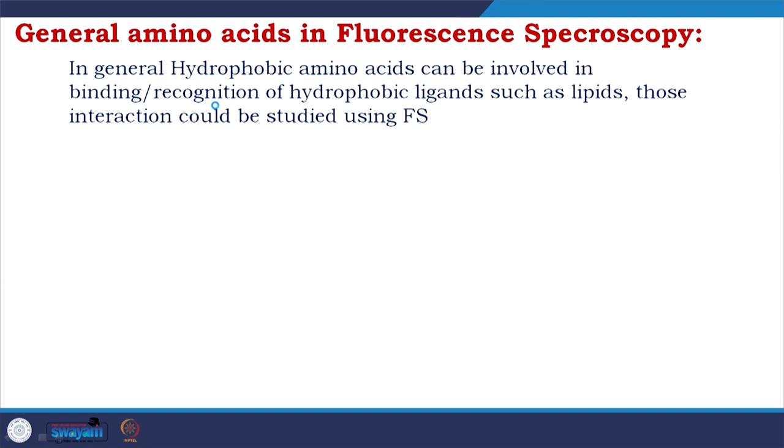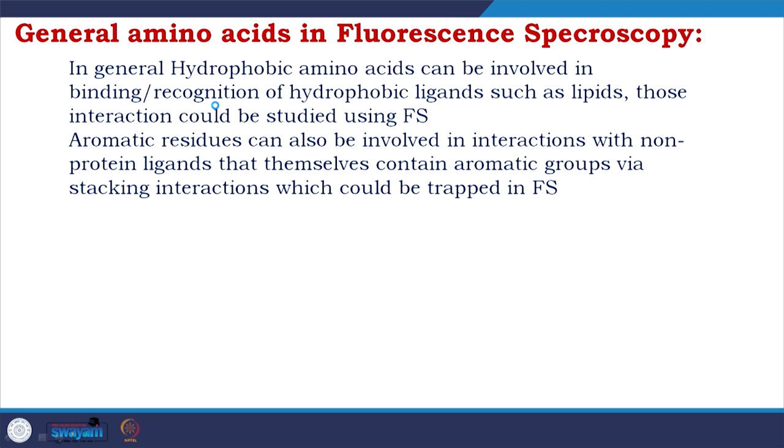So, if we look at other amino acids, in general, hydrophobic amino acids can be involved in binding recognition of hydrophobic ligands such as lipids, and those interactions could be studied using fluorescence spectra if we have a proper lipid containing a fluorescent group. Aromatic residues can also be involved in interaction with non-protein ligands that themselves contain aromatic groups via stacking interaction, which could again be studied using fluorescence spectroscopy.